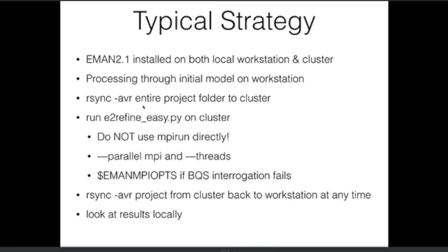Not only does this make sure that you've got all the files that you need when you're doing your refinements there, it also gives you a backup of your data. Now, if you have an environment where you have a shared file system where the cluster can see the same file system as your workstation, well, of course, that's fine as well. It's perfectly safe for that sort of computing for almost all operations. It's probably not a terrific idea to try and write to the same HDF file at the same time from two different computers on a shared file system. But other than that one caveat, there shouldn't be any problems with it.